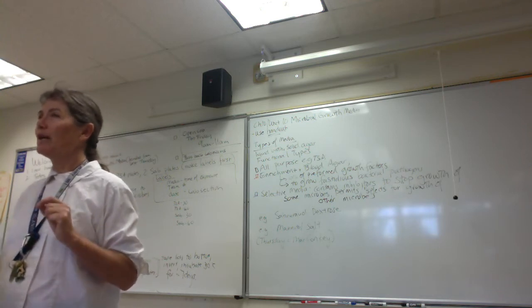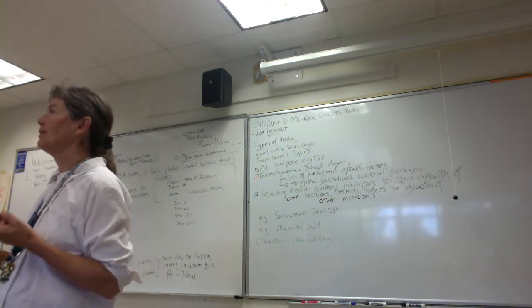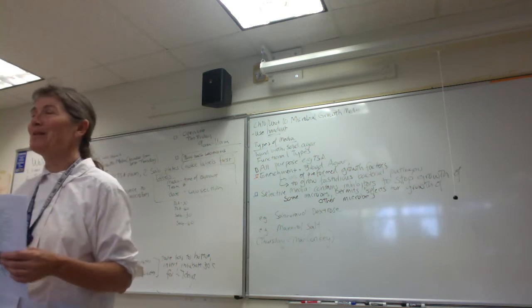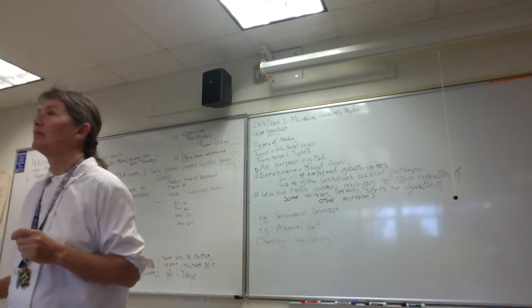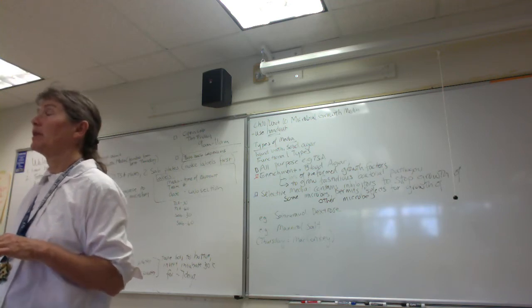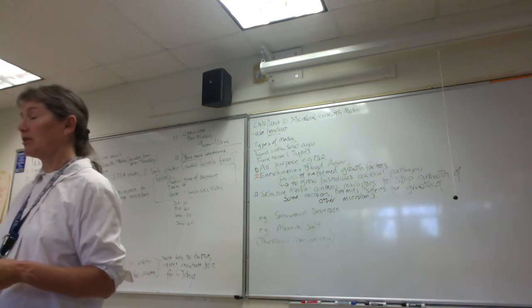Historically, I don't know why they say dextrose and glucose. It seems to me usually in medical facilities they call glucose dextrose, and usually in lab facilities they call it glucose. But anyway, glucose and dextrose are the same thing. So that high concentration of dextrose, glucose, can also help inhibit the growth of a lot of environmental bacteria. And again, the fungi are pretty comfortable growing at high glucose, dextrose concentrations.